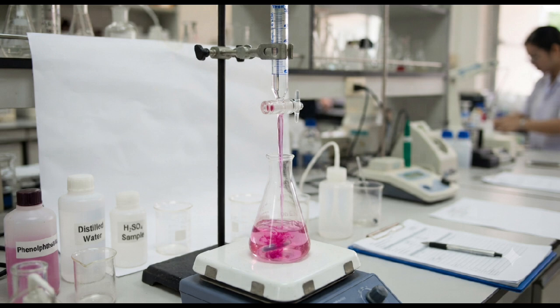What is titration? Titration is a qualitative and quantitative analytical technique in which a solution of known concentration called the titrant is added to a sample solution until the reaction reaches its endpoint. From the volume of titrant consumed, the amount or concentration of the analyte can be calculated.